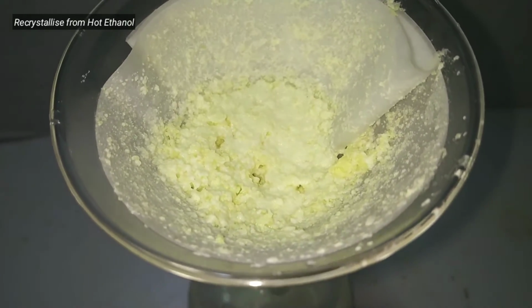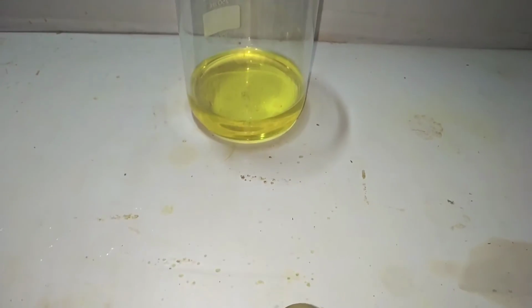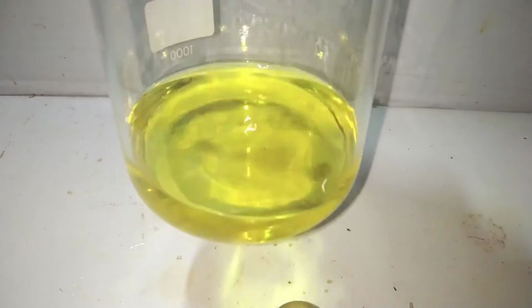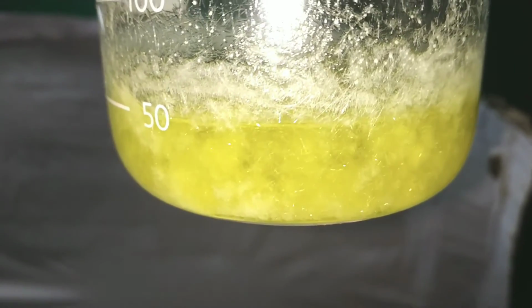The next step is to recrystallize the product, and recrystallization is done with hot ethanol. Here we have dissolved the crude Benzil in the ethyl alcohol solution, and we will allow this hot solution to cool down, and on cooling you can see the crystals of pure Benzil have separated out. Now we will filter this and air dry the product.